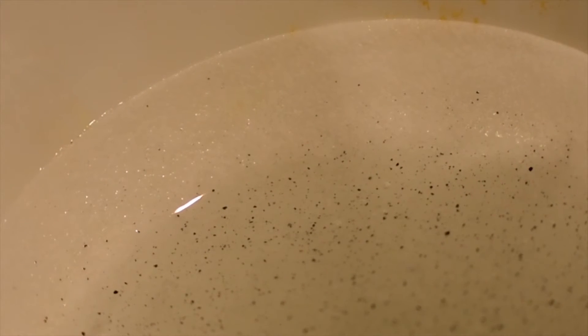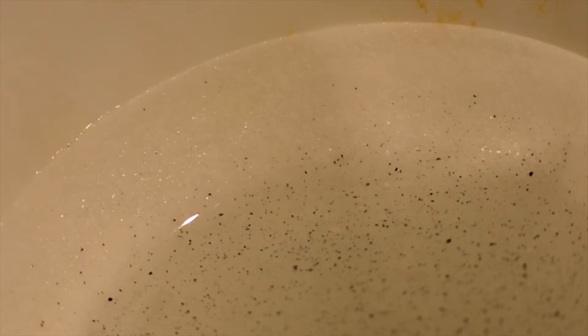Now we're left with a solution containing cadmium chloride and a little bit of excess cadmium. This just needs to be filtered. In the flask below we'll be left with a good-quality solution of cadmium chloride, and then we can go ahead to the next step: converting this into the carbonate.